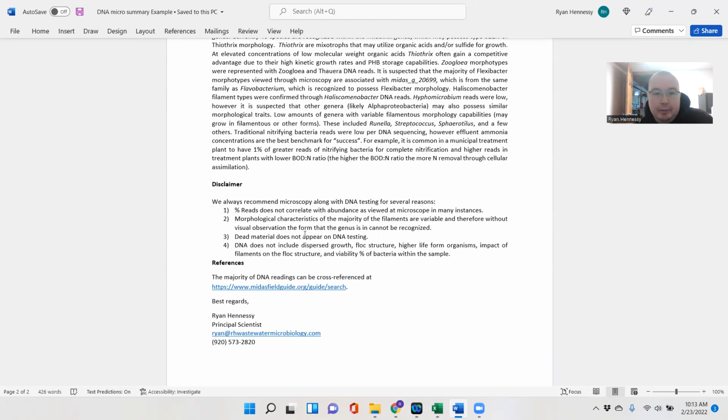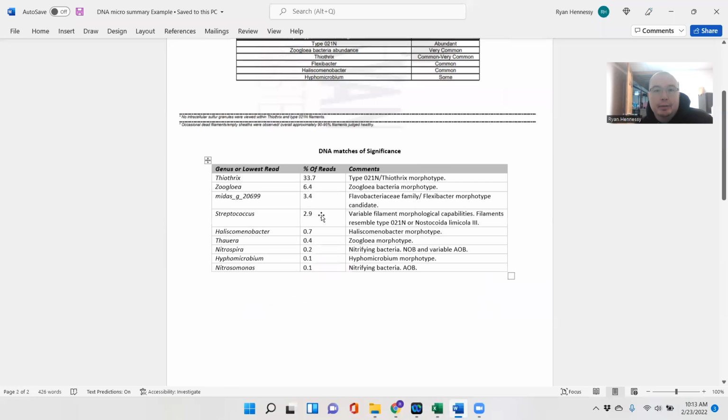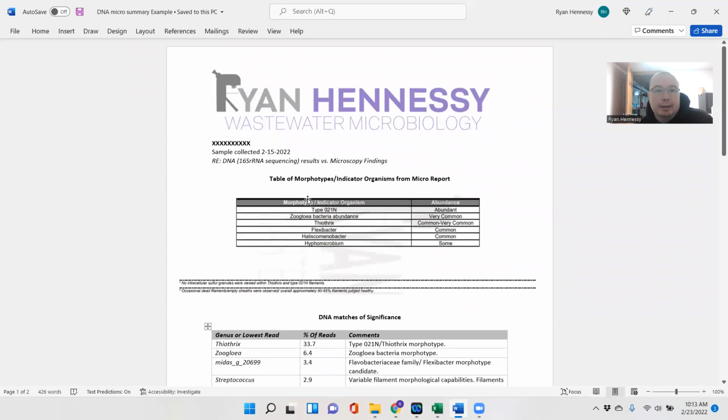Anyways, I just wanted to share that with you. This is the DNA to microscopy evaluation report.